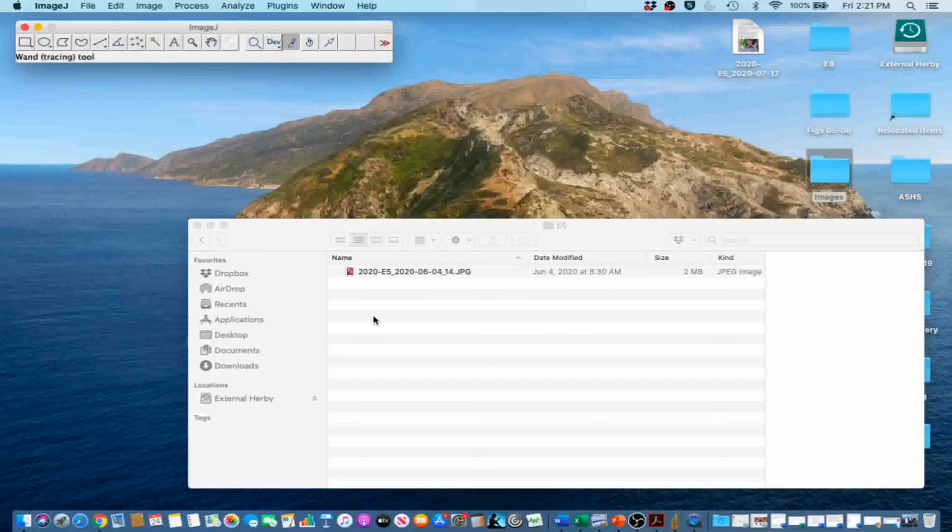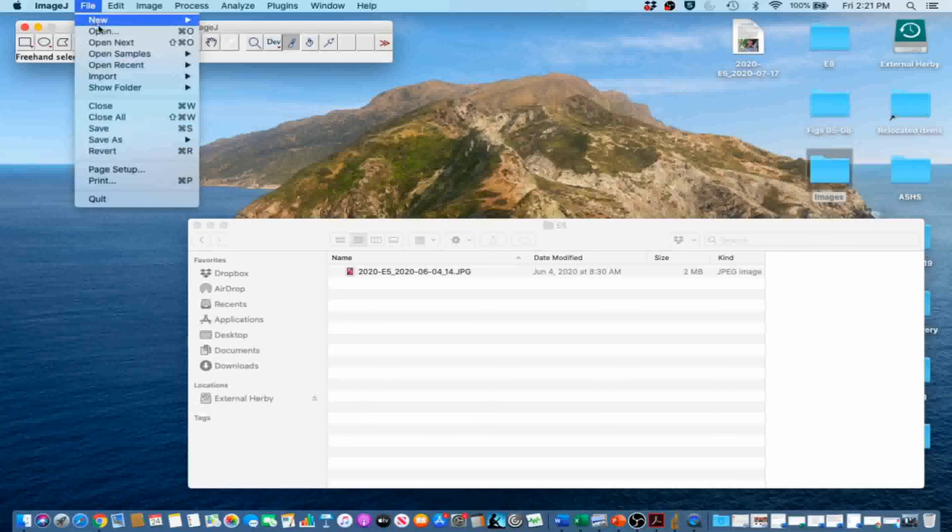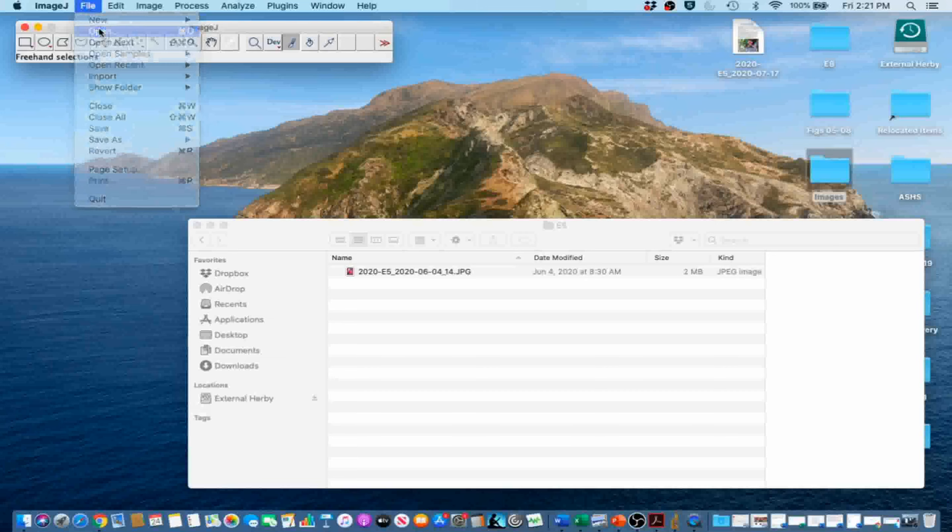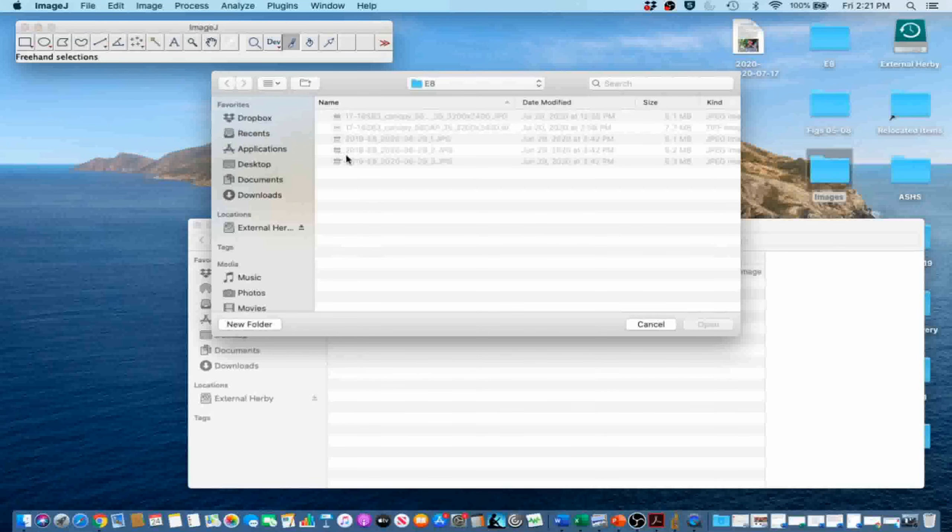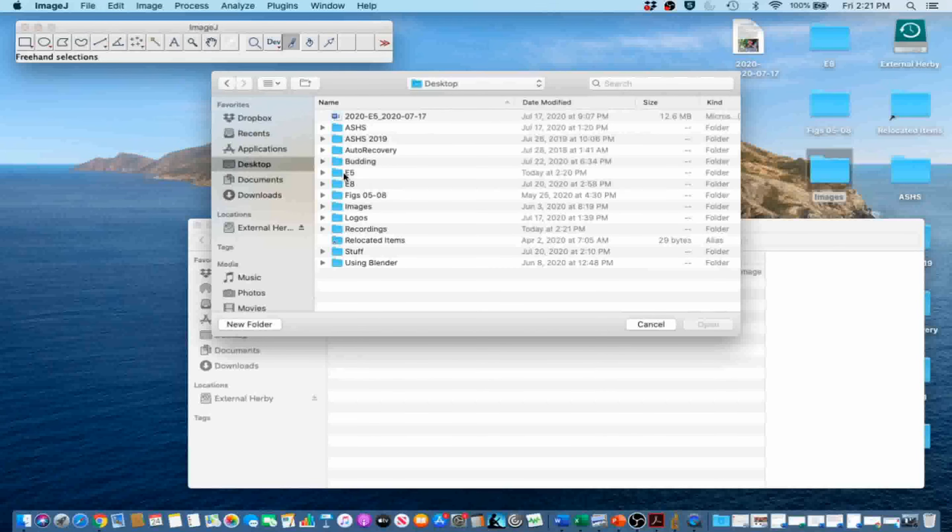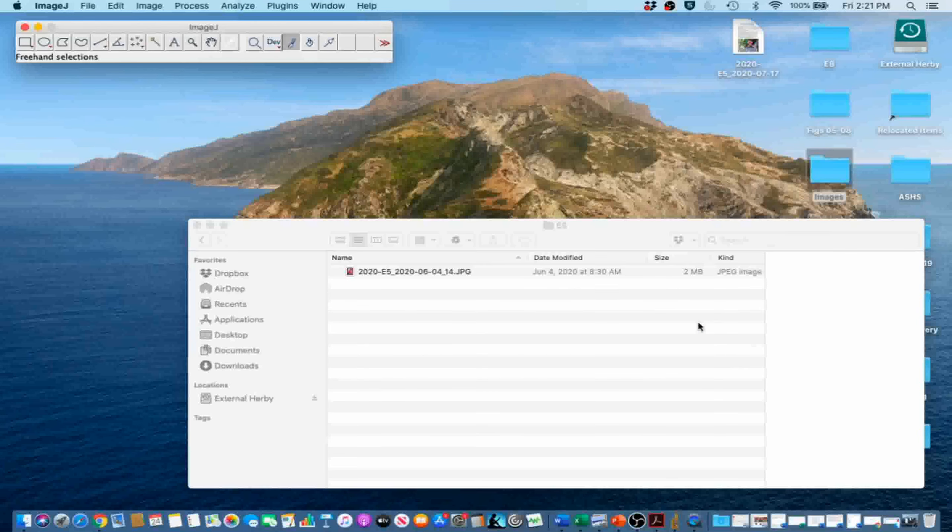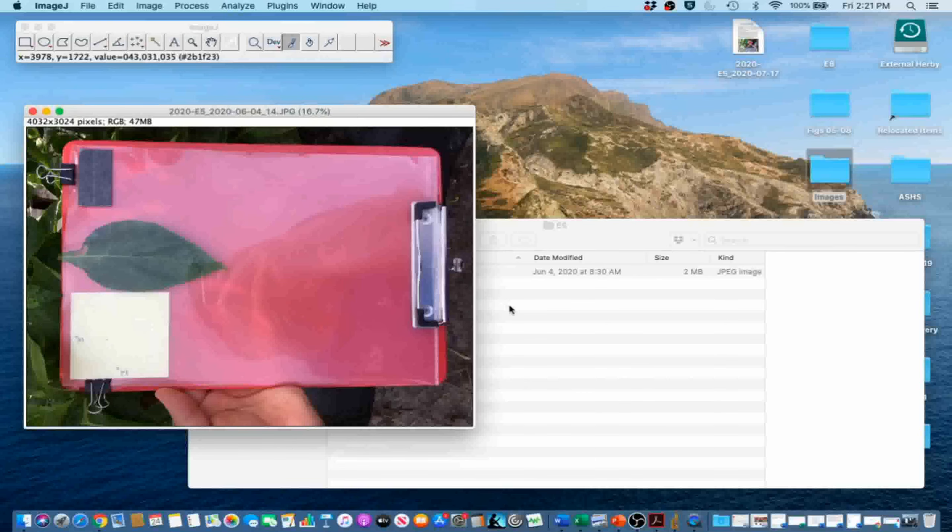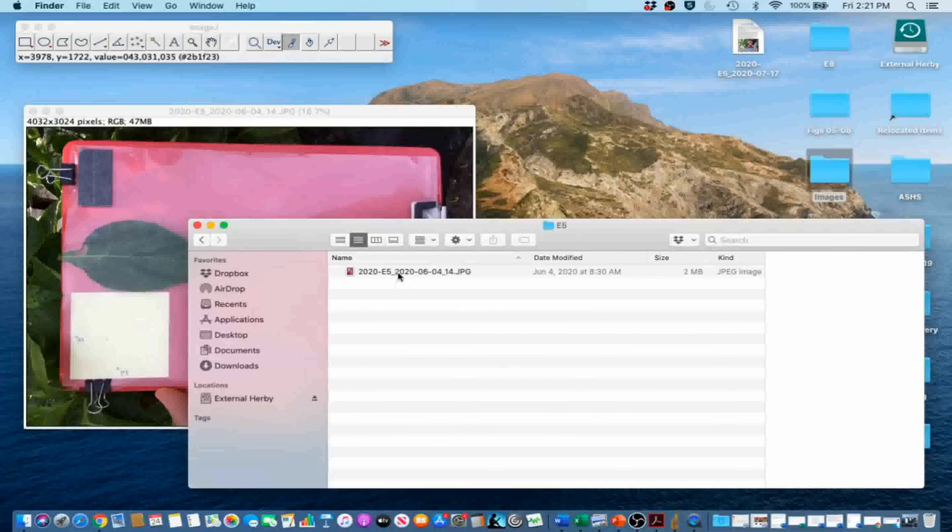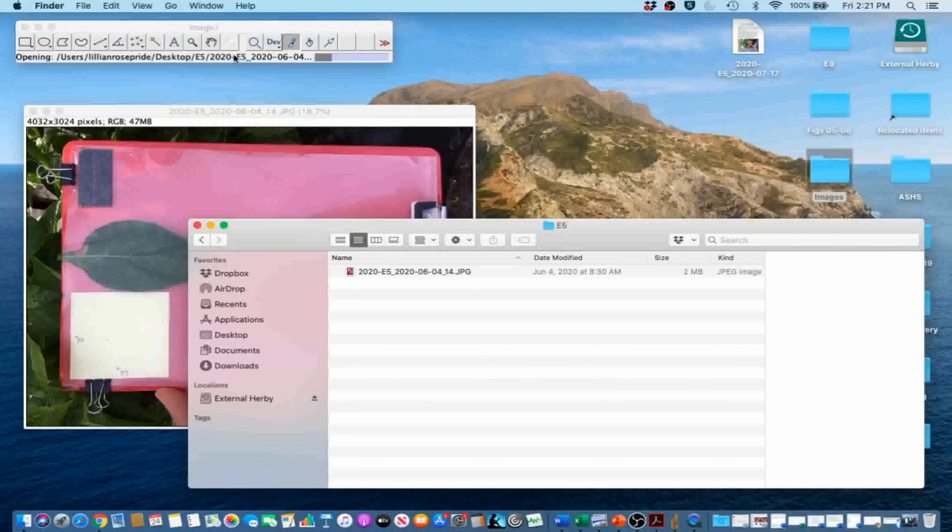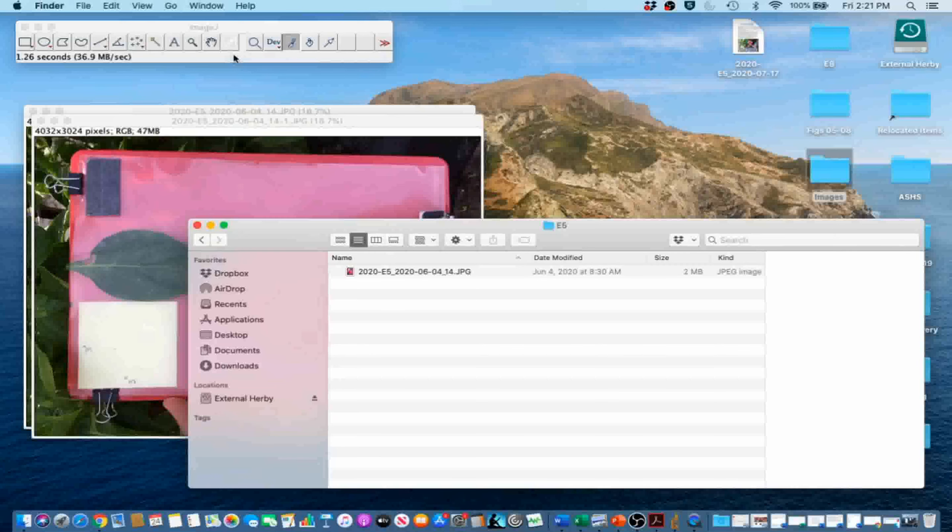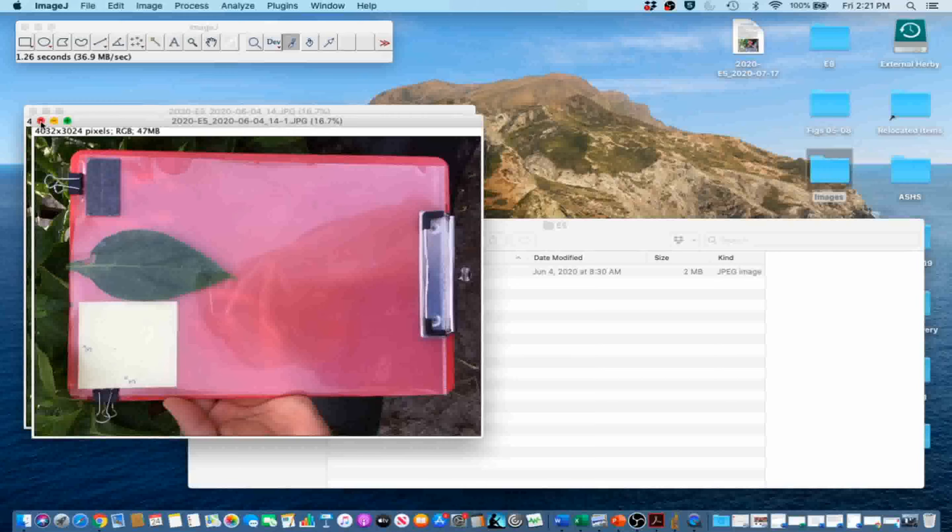In order to set scale for our image, first we are going to import the image. Go to File, Open, and navigate to the image. Or drag the image onto the graphical user interface. Both actions will open the image.